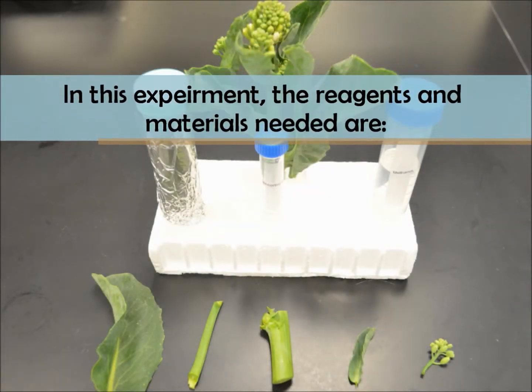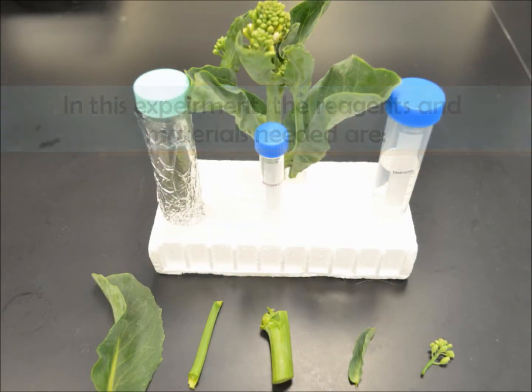Antioxidants in vegetables. In this experiment, the reagents and materials needed are as follows.